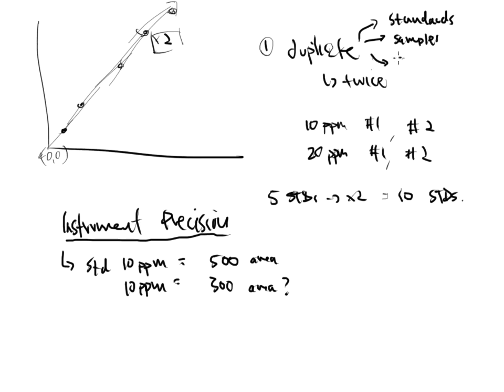And we can also have duplicates of what we call the field samples. And those are the samples that we collect in the environment, right? If we go out to a source, whether that's soil, a lake, a stream, another company, a chemical manufacturing plant, and we collect samples out in the field and transport those back to the laboratory. Sometimes we'll do those field sample duplicates as well, meaning that we'll collect 2 of the same type of sample, and we'll analyze both of them in a laboratory just to make sure that the machine is telling me the right thing, right?